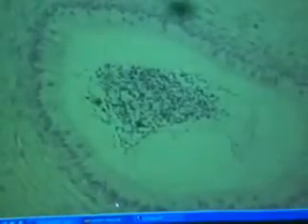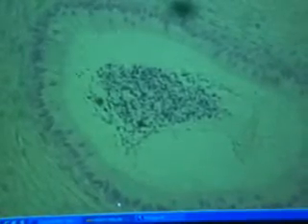Okay. So questions I could ask: identify tissue. What about that tissue? Definitely some stereocilia there. Push that sperm along. Yeah, that looks pseudostratified to me.